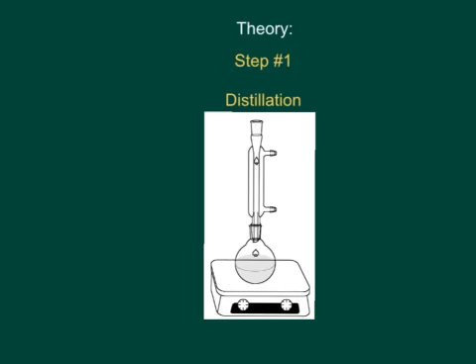Now our first step in this experiment is to do distillation. But before we could start distillation, we add water into the light bulb flask with sodium carbonate and heat it up to dissolve the sodium carbonate. After that we add tea leaves inside the light bulb flask, which will then start extracting the caffeine and all the other substances inside the tea leaves as well. The reason we have the water jacketed condenser upright is because as the caffeine is being extracted from the tea leaves, vapor could also be going up. So we add water going in here, coming out here, to condense this vapor coming up to go back down.